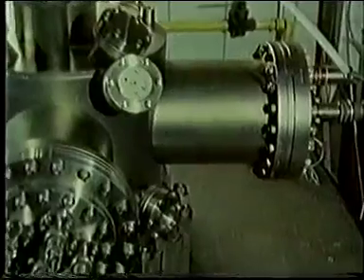At the moment, the instrument contains a clean iron 100 surface. Its structure is based on a simple square lattice. To start the experiment, the sample is turned to face the LEED detector, here at the back of the spectrometer chamber. The diffraction pattern, like the surface lattice, is also a square array.